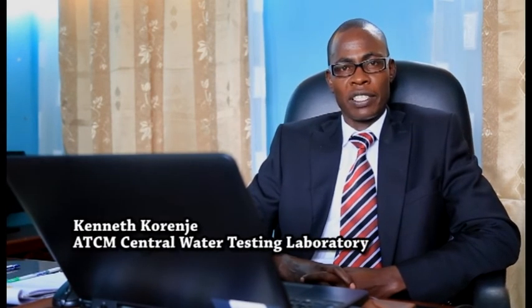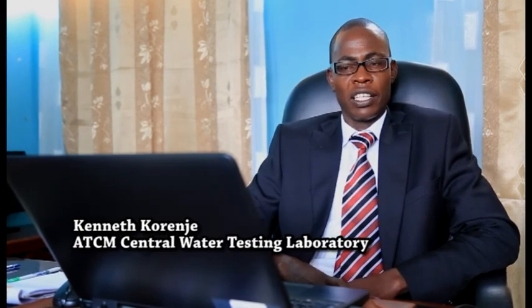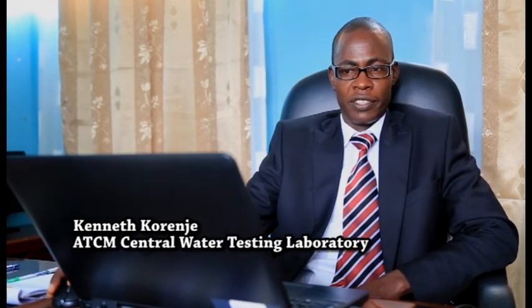The second benefit to our customers is trust. Through experience, we have developed an unrivaled reputation and integrity in the water sector as a laboratory of choice, and that is why we are one of the regional water laboratories in Eastern Central Africa. In this case, we provide unbiased analytical solutions to our customers to assure that their products and processes meet the maximum required standards. Our customers will benefit from quality.